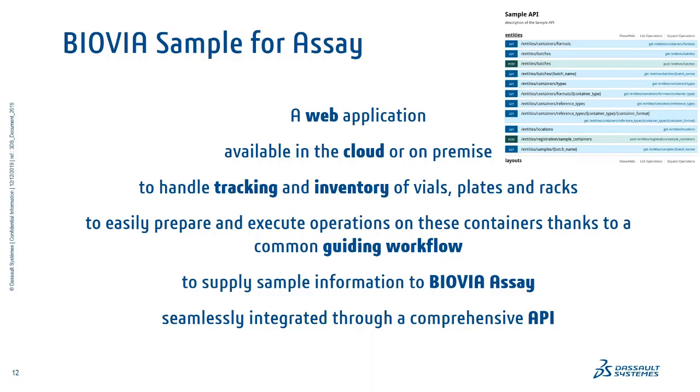So, for example, typical integrations on the informatics end will be with registration systems or inventory systems. And on the hardware side, that would be about integrating with, for example, the liquid handlers to be able to provide instructions to liquid handlers and receive information from those liquid handlers.